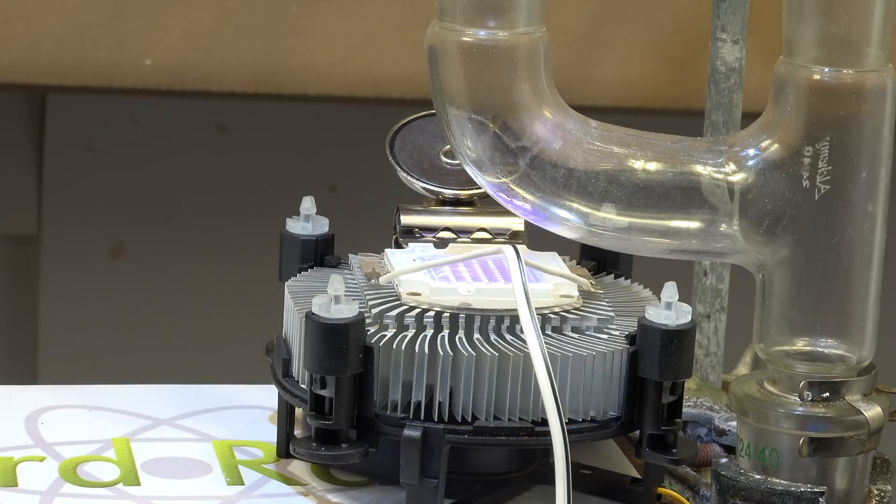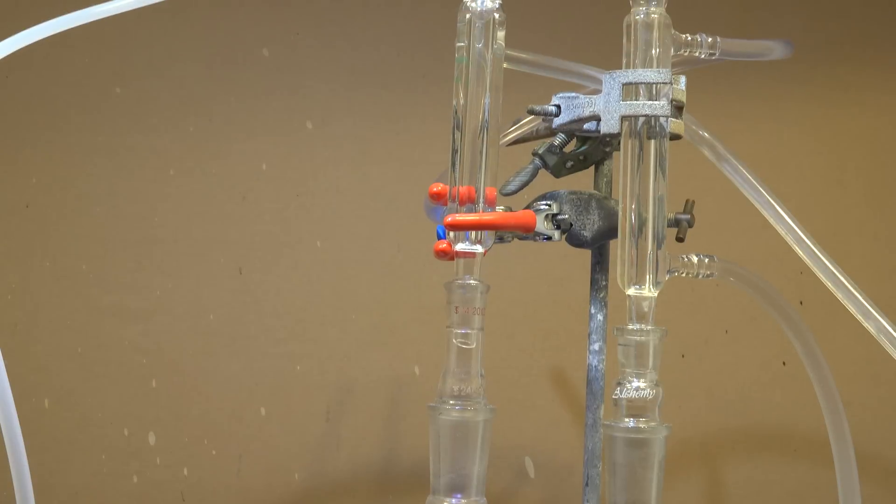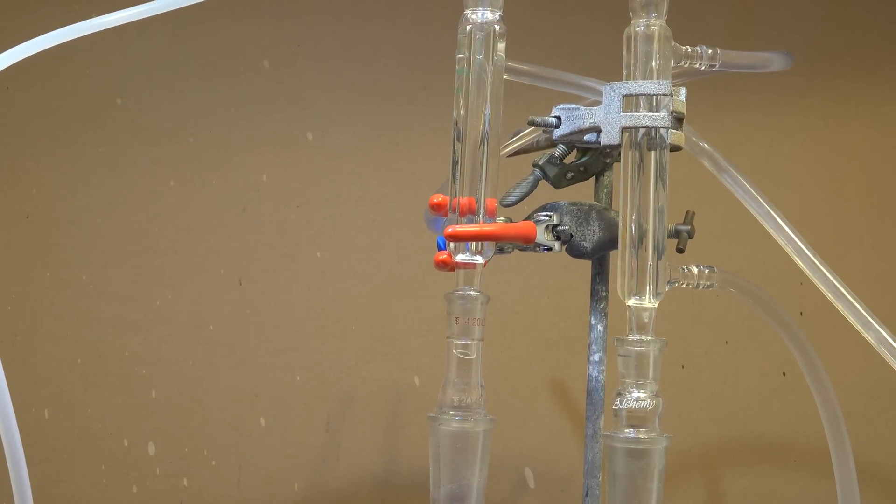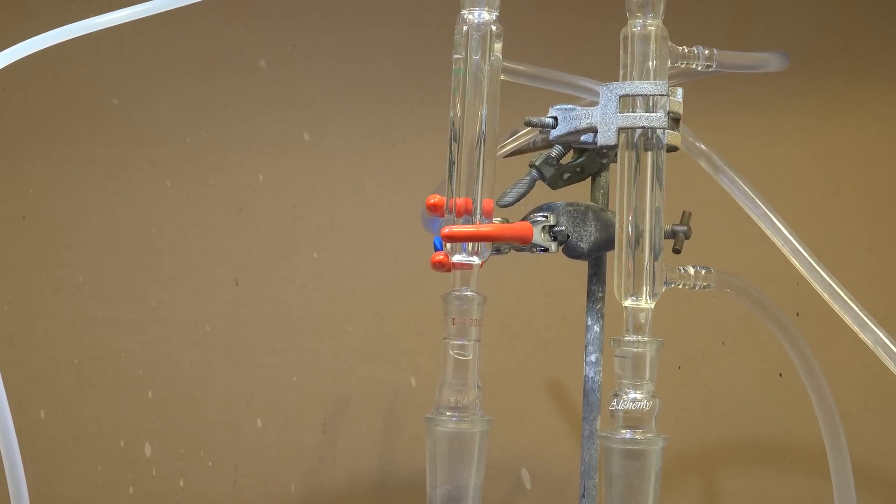The UV light initiates the reaction between the gases and the heavier products will condense in this exit column and drip back down into the boiling flask. The lighter byproducts will not condense and exit out the top.